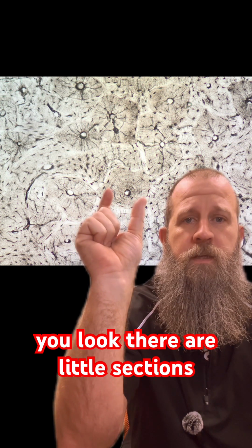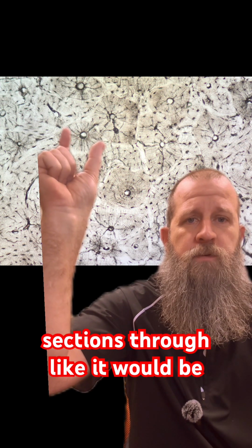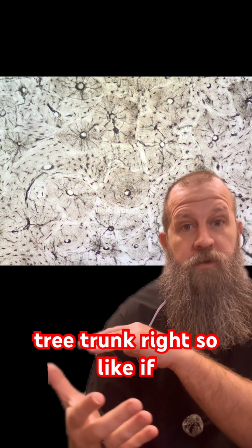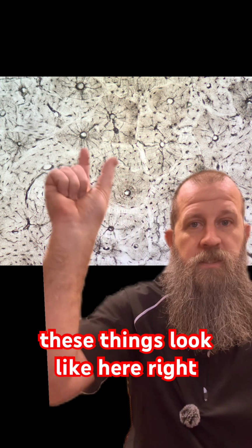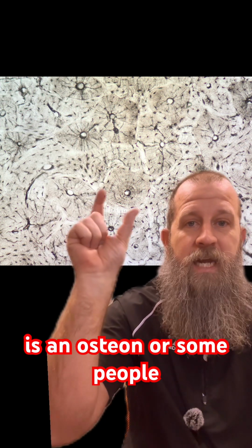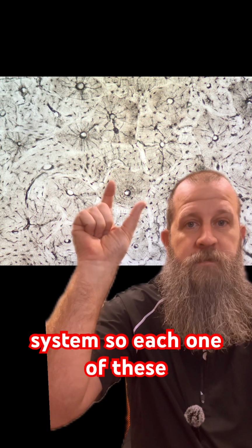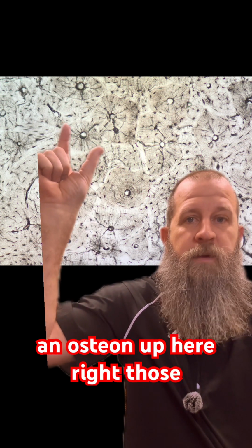If you look, there are little sections that almost look like circular sections, like a section through a tree trunk. If you cut a tree off and were looking down into the stump, that's kind of what these look like. Those structures make up what we call osteons. This is an osteon, or some people refer to these as a Haversian system. Each one of these is an osteon, and this is an osteon up here.